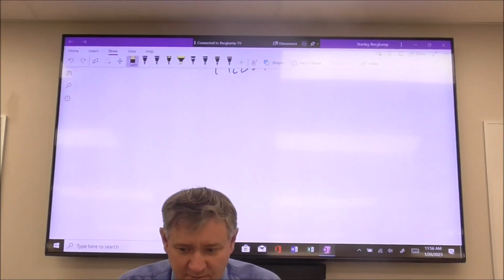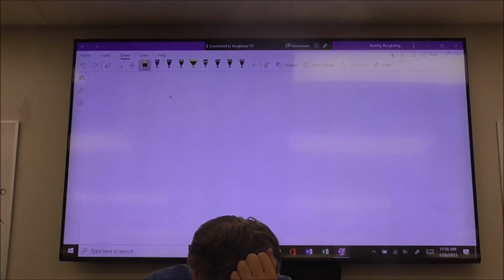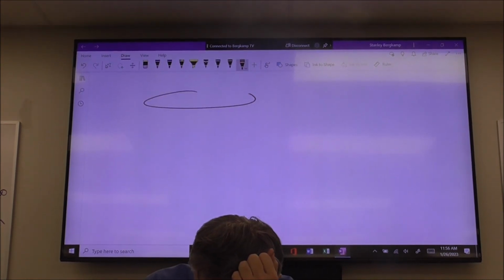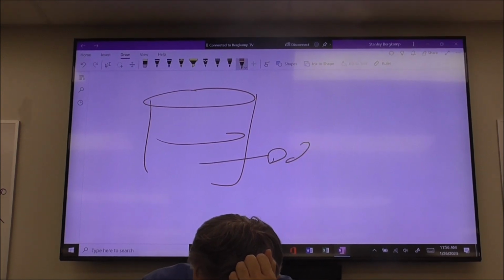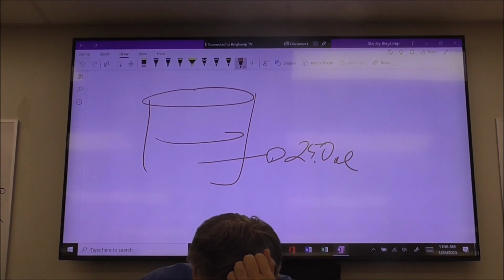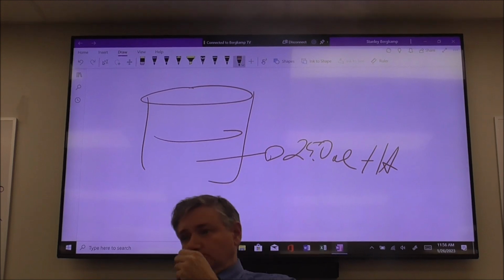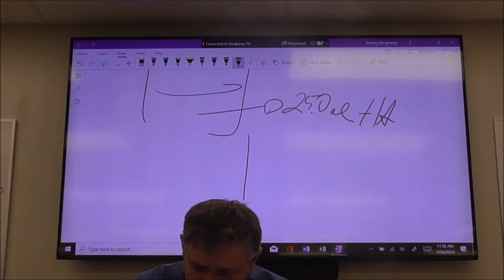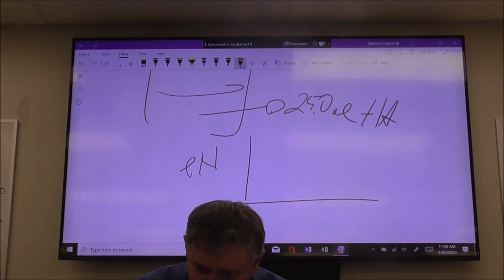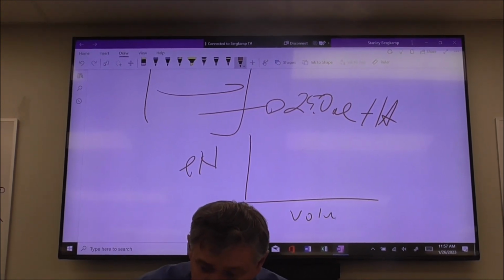So here's where you're at right now. What you all did yesterday is that all you took was straight acetic acid. That's all you had. Boom, that's it. You did the titration and pH.